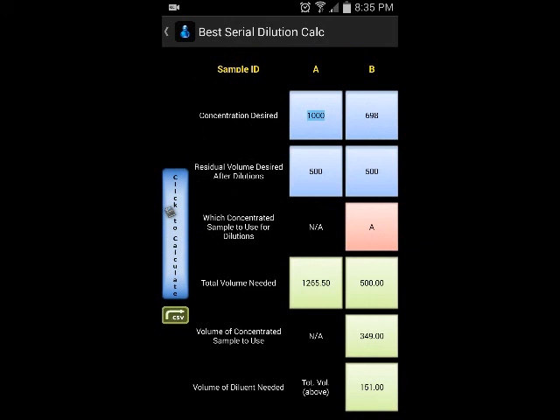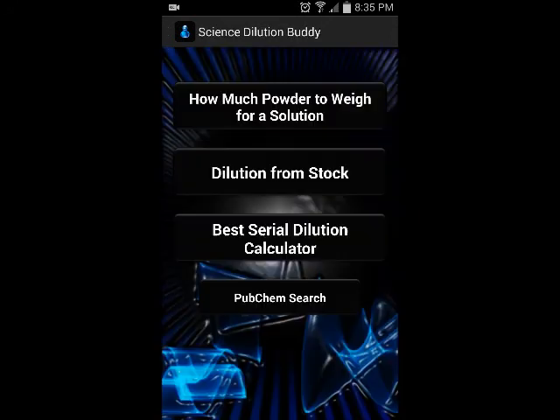Notice the app automatically expands when you dismiss the keypad, and it will automatically expand for larger devices like a tablet. I'm using the Galaxy Note 3 here just to give you an idea of the screen size, which is fairly large but not quite a tablet.